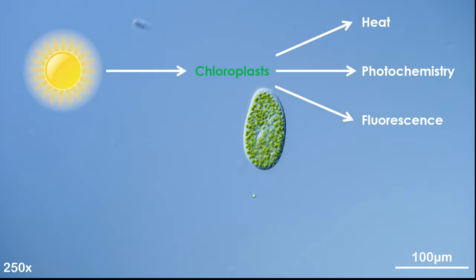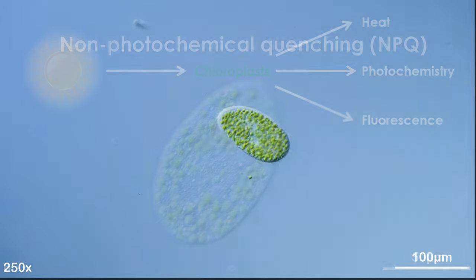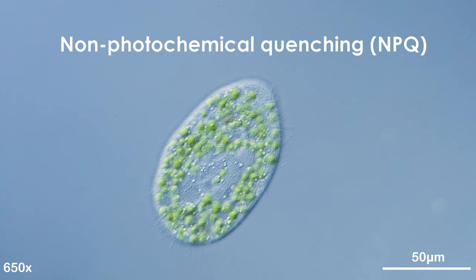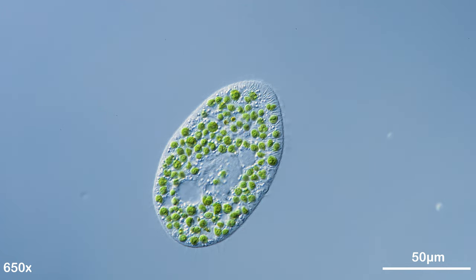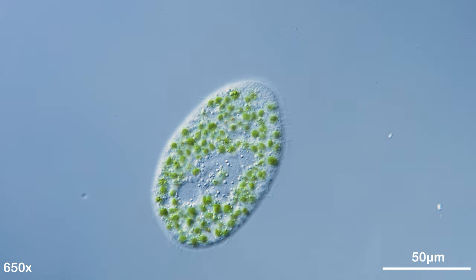Heat dissipation occurs through a process called non-photochemical quenching, which is a rapid mechanism using multiple molecular pathways to protect a cell. The best part for us microscopists is we can actually observe it using a fluorescence microscope.